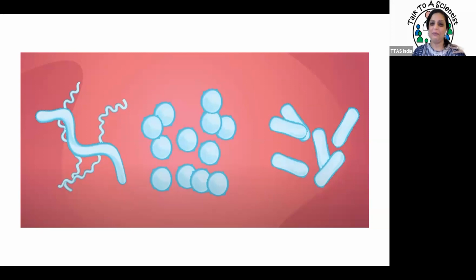Great question. And then one more question just popped up. If you were looking through a microscope at a bacteria, won't the lens get infected? No. So that is definitely something to think about. When we're looking through the microscope, there is a distance between your sample, where your bacteria is, and where you're actually looking at it. So you are protected for sure, but there is a working distance between that. So you're definitely protected from that.